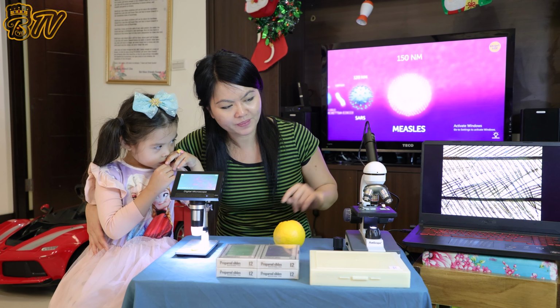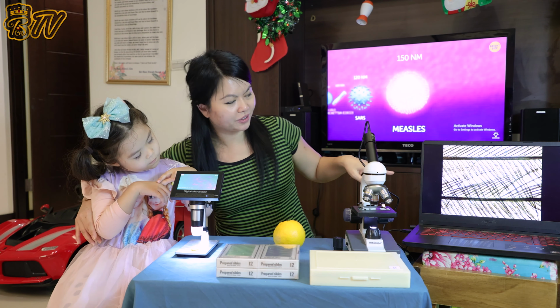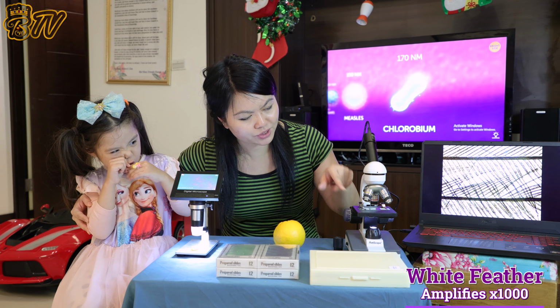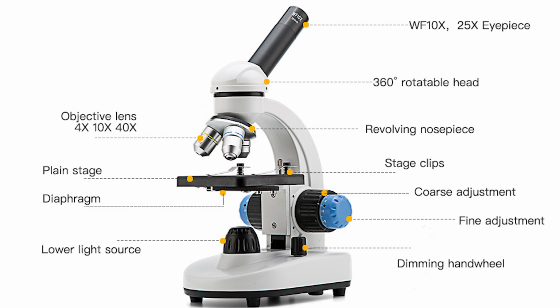Annabelle, come look at the feather. Okay, so this gets hooked up completely to the computer. Annabelle, you like the feather? Yeah, pretty white feathers. Okay, so there's a feather right underneath the microscope. This gets amplified 1,000 times, and this whole set is about $150. It's a little bit pricey.